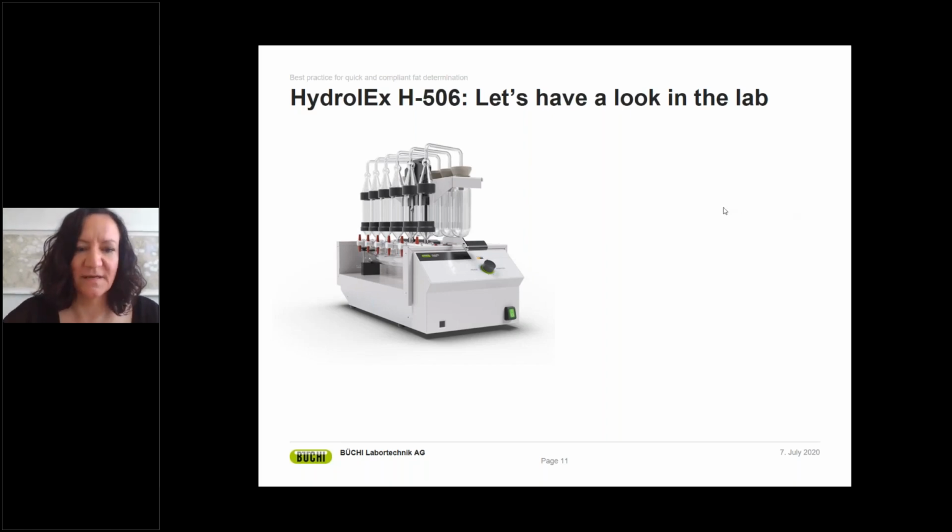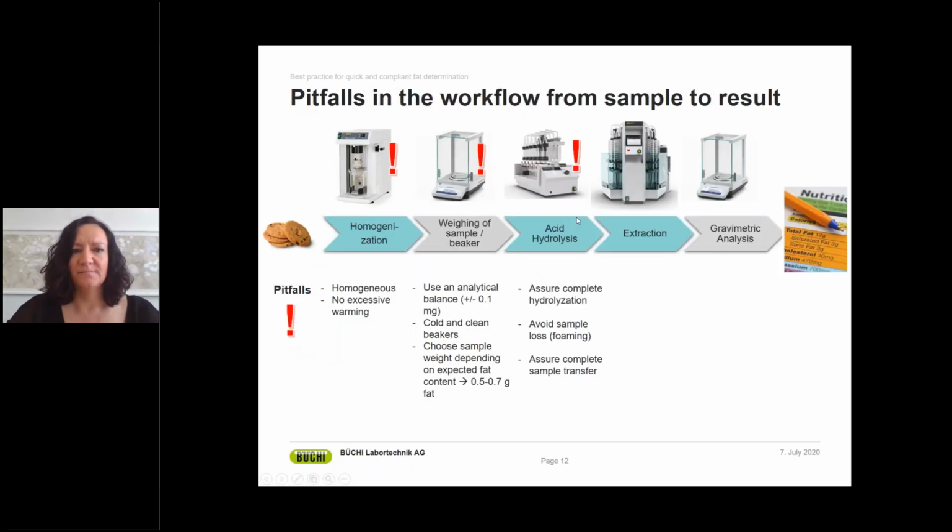Thank you, Maren, for this insight in the laboratory. We'll now go on to the extraction step. So after hydrolysis, the samples are dried and cooled down, and then they're ready to be extracted.